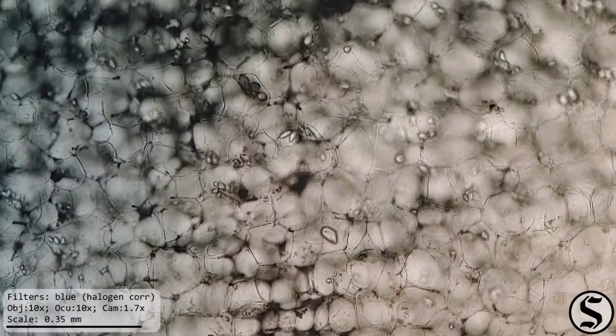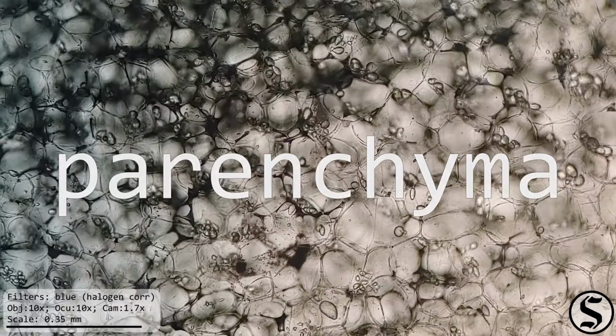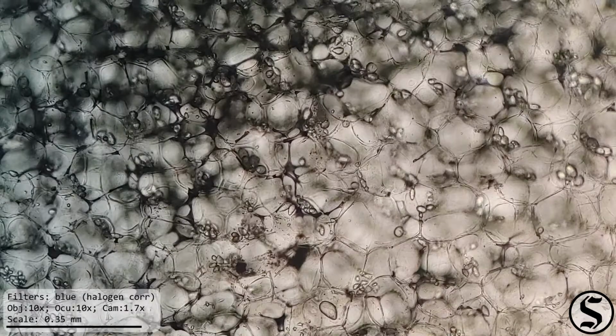And as we go further up into the plant, we reach the parenchyma, which comes from the Greek parenchyne, to pour in. That's the storage area of the plant. And we can see that, indeed, stored in this plant is starch. And we'll talk about starch more in a bit when we get to the main parenchyma of the potato.